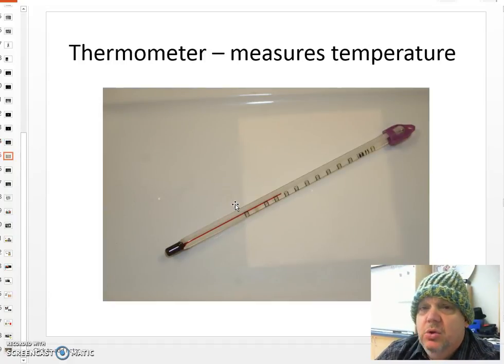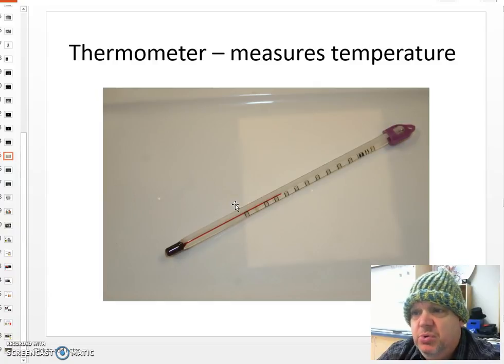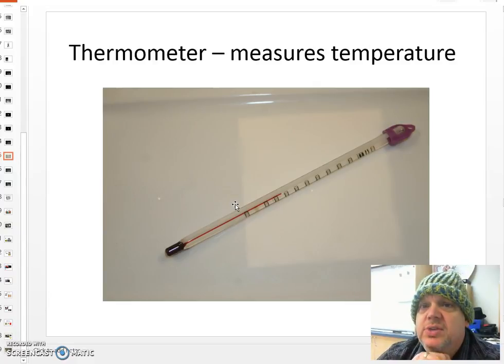Thermometers. Real shocker. Thermometers measure temperature. Now, we have two different size thermometers. This is one of our smaller ones. They do measure in Fahrenheit and Celsius, but we are in a chemistry class, and because it's a science class, we use the Celsius, not the Fahrenheit. Now, we can convert to Kelvin if we need to. That's by using a formula. That's really no big deal. The thermometers are fragile, however, because they are glass.